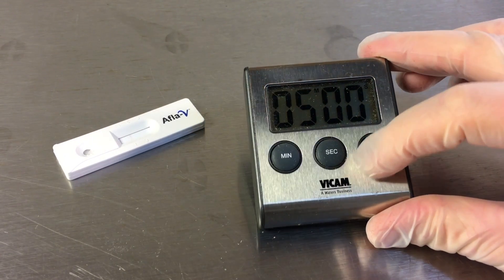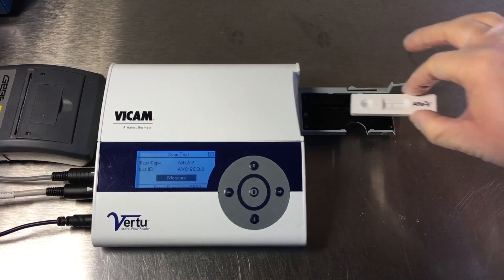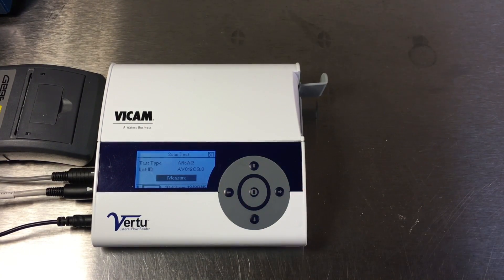Allow the strip test to develop for 5 minutes on a flat surface. Insert the AFLA-V strip test into the Virtu Reader. Press the center button quickly to start the test.